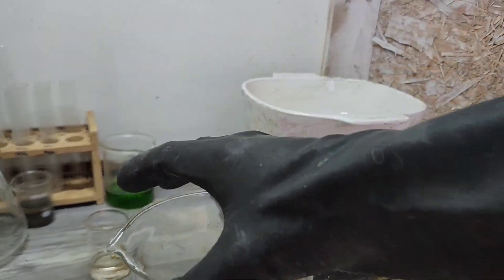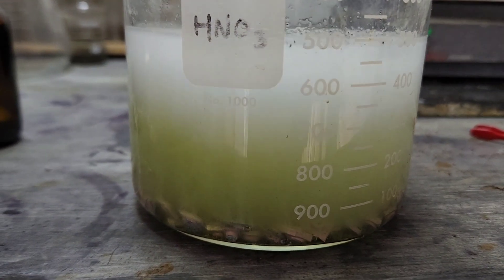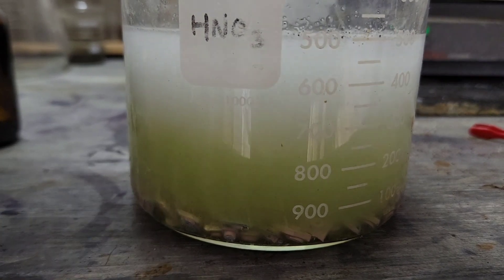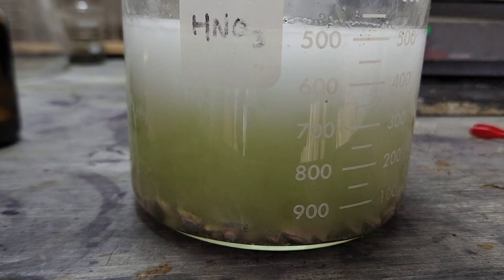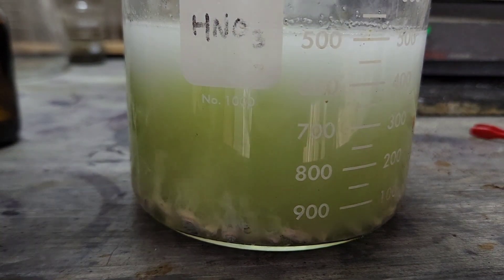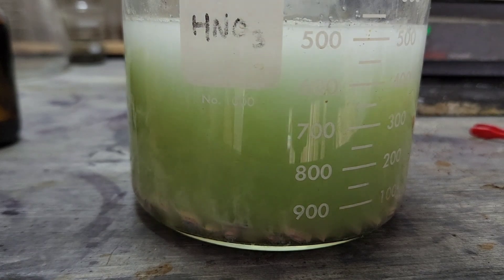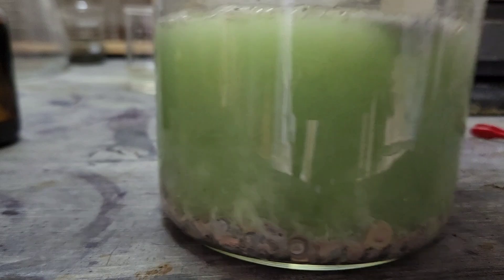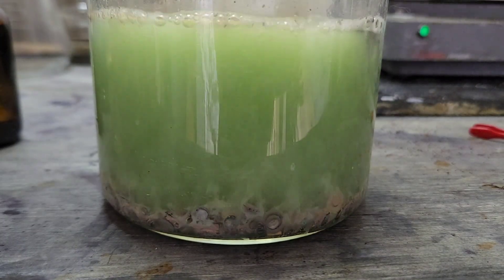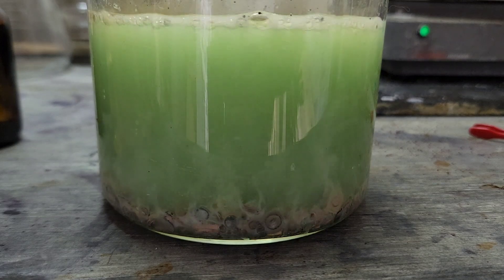Actually, before we turn the heat on, take a peek at that. I think what I'm going to do is put two scoops in right off the bat. Oh yeah, look at that. Creating a nice reaction right off the bat. We got plenty of fumes. I'm going to go ahead and put it on the fume hood here.